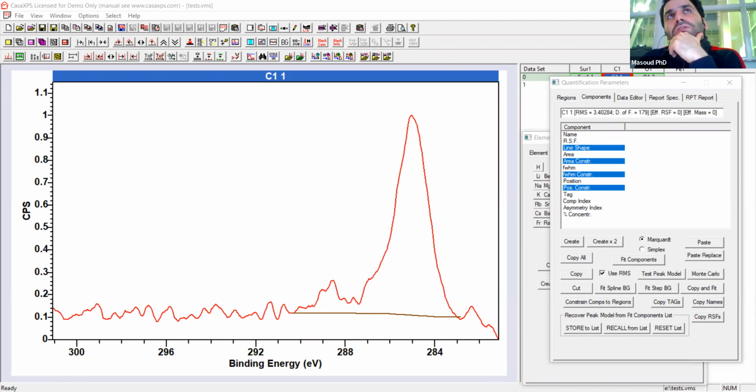And this also gives us more information about which type of material usually gives which type of components, and there are also some examples of fitting which give us some idea about the elements, and other useful information which can help when you are dealing with peak fitting and creating a deconvolution model.